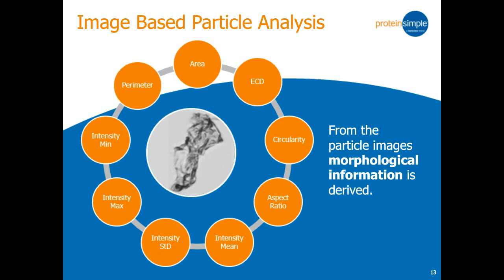So we can measure things such as the size, shape, and translucence or opacity of the particle in order to help differentiate different subpopulations of particles within the sample. One of the classic examples of this is differentiating protein aggregates from silicon oil in parenteral products. But as Dr. Van Beers is going to illustrate, this can be applied to other microparticles as well.